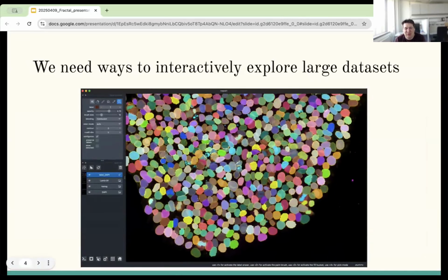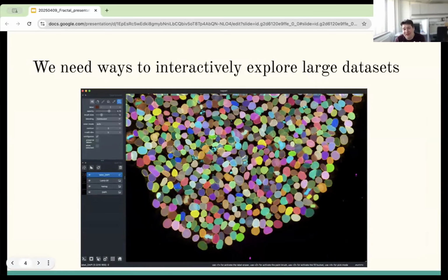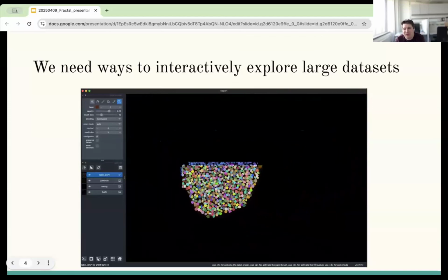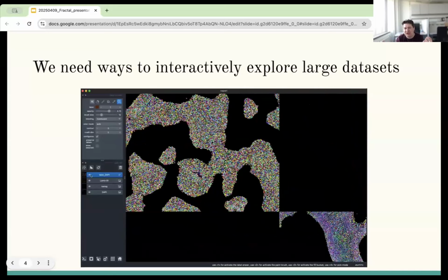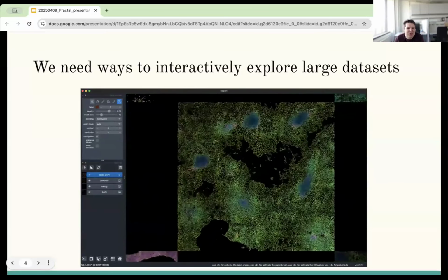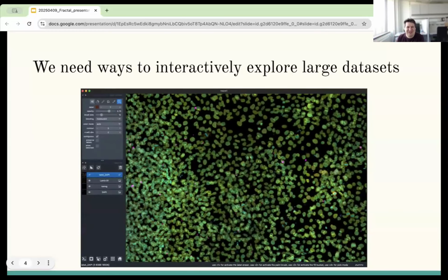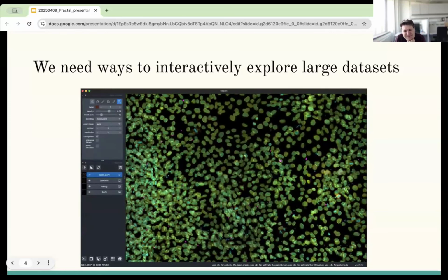Did our processing do what we thought it would do? And we want to be able to do this in an interactive fashion, a bit like Google Maps, so that we can really browse around those data sets, zoom out, compare different conditions, maybe zoom into something else, and explore what actually happens. This is a much more useful way of taking the same number of original images that the microscope created than if we'd open them one at a time, single gray channel, single plane images.